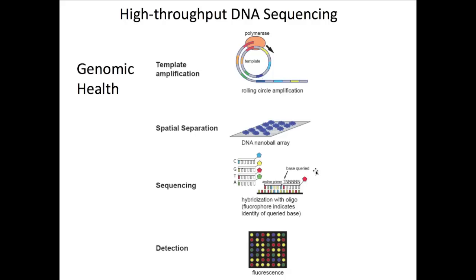And from that, by doing multiple cycles where you vary the position that's known and carry out this sort of hybridization followed by ligation, you can then infer what sequence was present in the unknown tag region of that template. And in a similar manner as I described with the Illumina, the readout is by looking at what fluorescent color is present at each spot during each cycle. And that's basically how that instrumentation works.